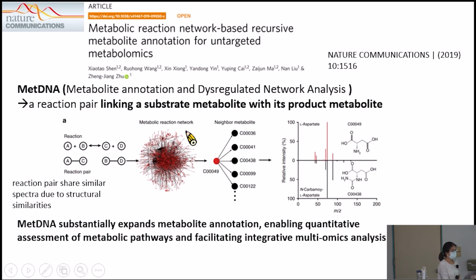What kind of component, what does it mean? For example, in a cell, as Dr. Lin mentioned about the cancer cell, if there is only one single cell, and this single cell has amino acid inside, lipid inside, and carbohydrate inside, these three units in one cell will represent different peaks at different time courses.